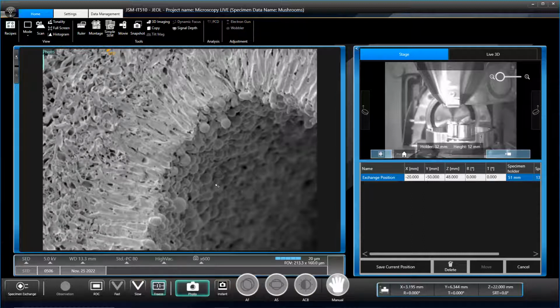We'll probably have a nice sunset and take some other pictures as well. It would be cool to see if, in future developments of research into ecology and mushrooms and everything, the EM will be more used.